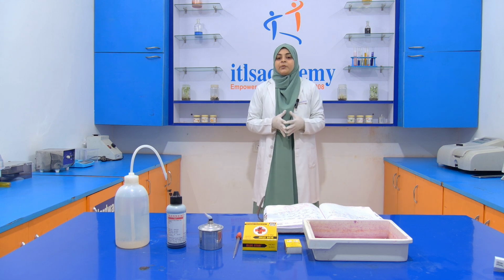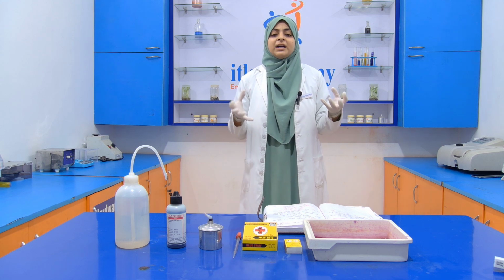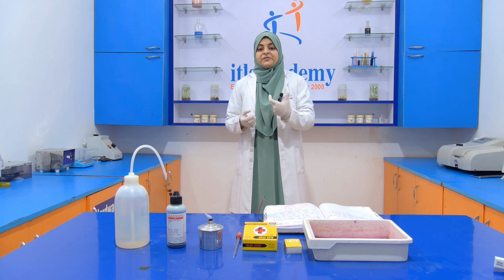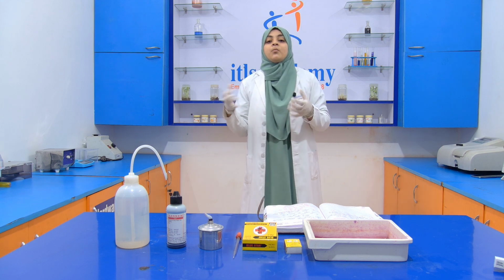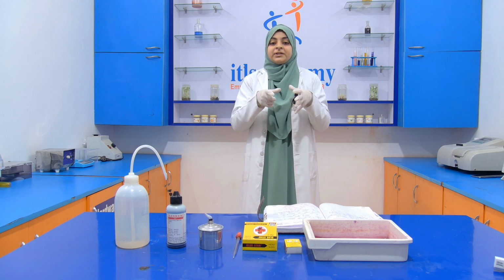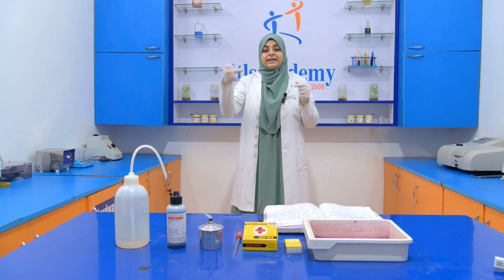Why? I'm going to explain to you. Direct staining uses a dye with a positively charged portion. When we use a dye in positive staining, that dye has a positive charge, and mostly the bacterial cells are negatively charged. So when they both come in contact with each other, they attract towards each other, and the dye colors the bacterial cell.